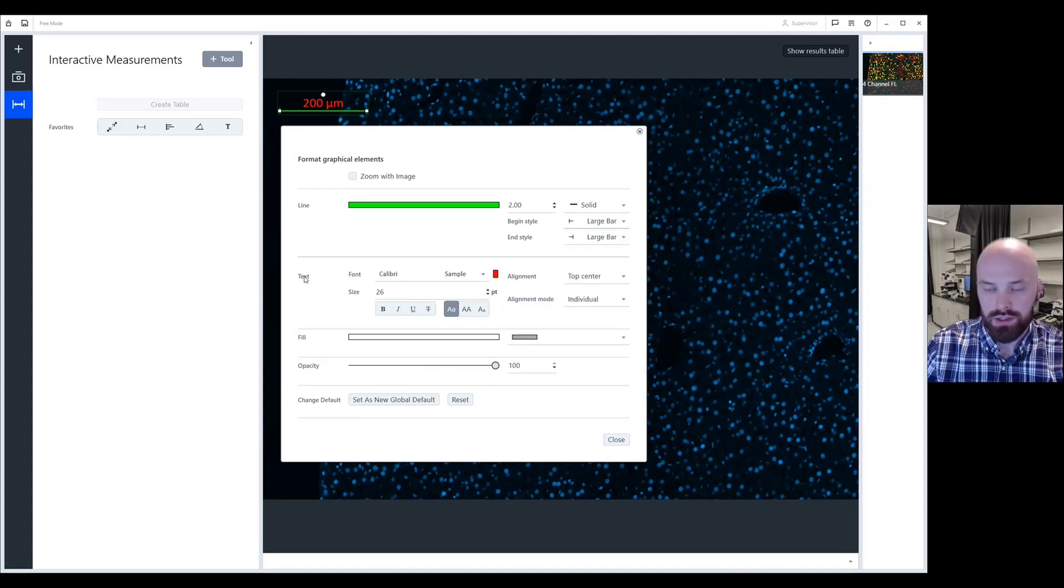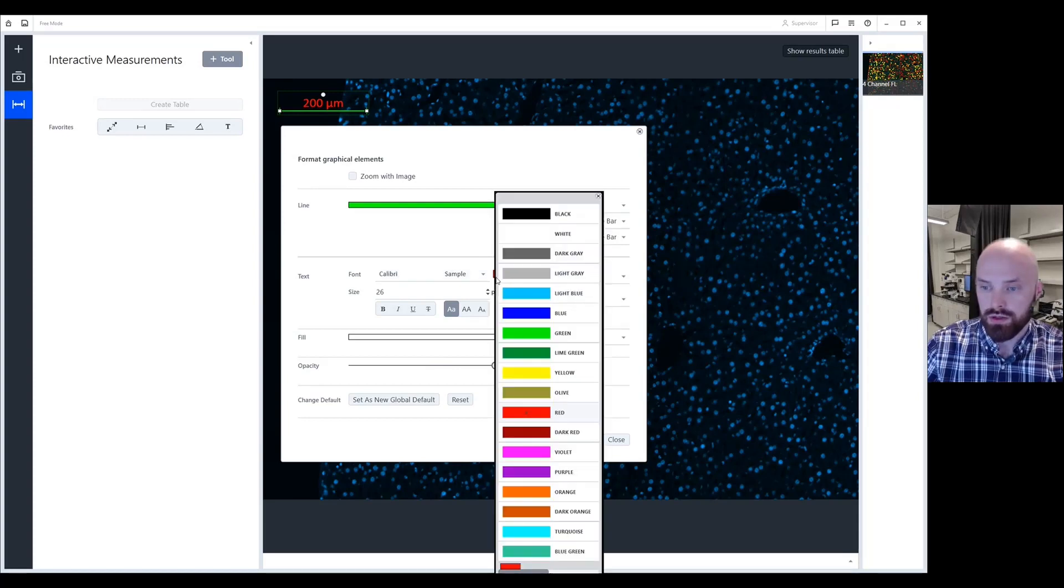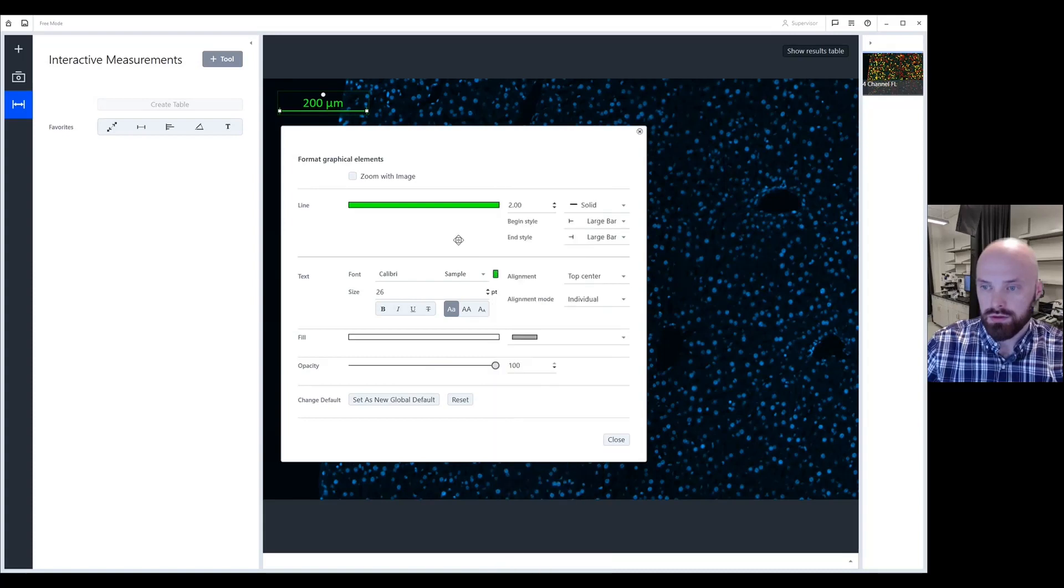Moving down here are text options. You can choose to change the style of the font as well as the color. Here's how you change the alignment of the text itself.